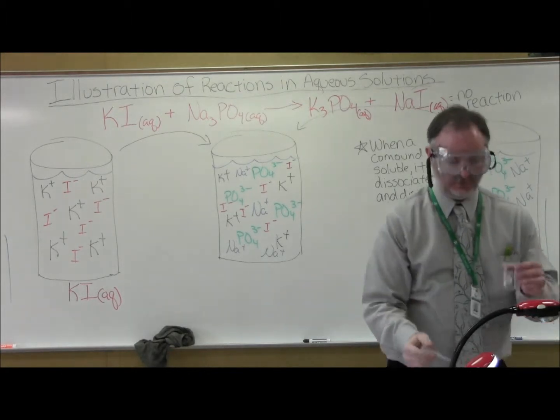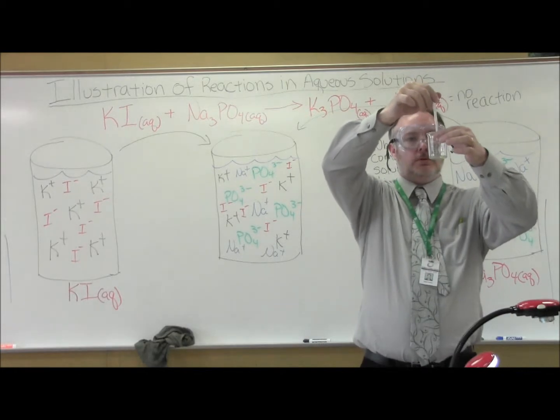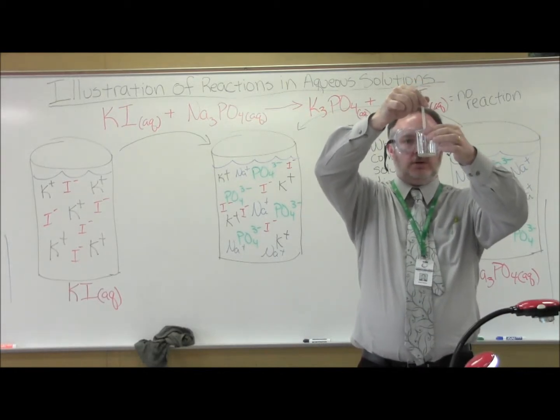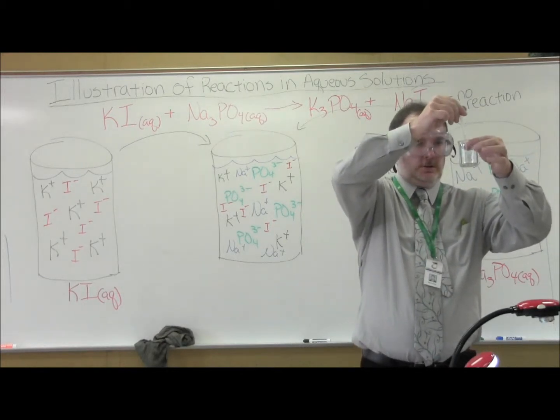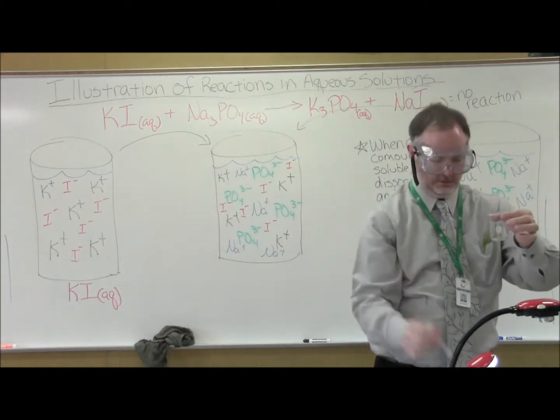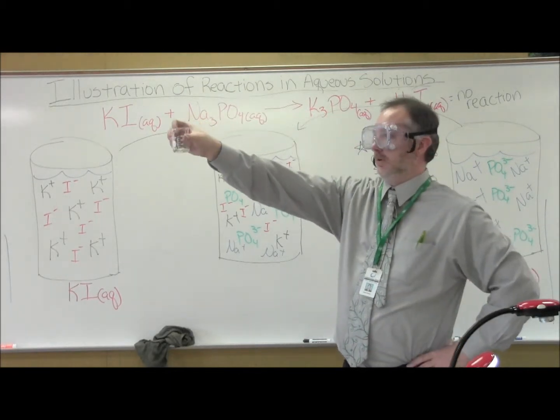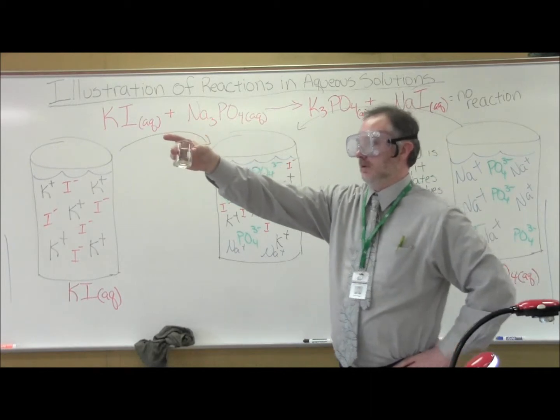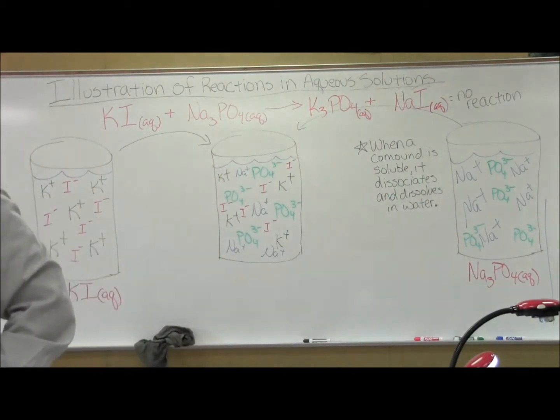Alright. So what's supposed to happen if I put some sodium phosphate in here? Still looks clear. Let's put a little more. It's gonna explode. Alright. Good, nothing happened. Just like we said. Still clear liquid. Still clear liquid.